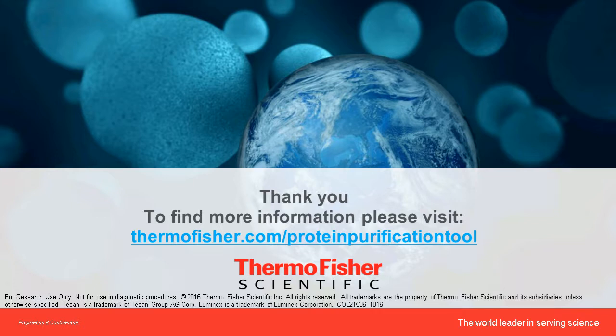Most of the targets, 1 microgram of antibody is all you need. But a few targets you may have to go to 3 micrograms of antibody because the antibody has a lower affinity for that particular target, and you want to make sure that you capture 100% of the targets from your native samples.